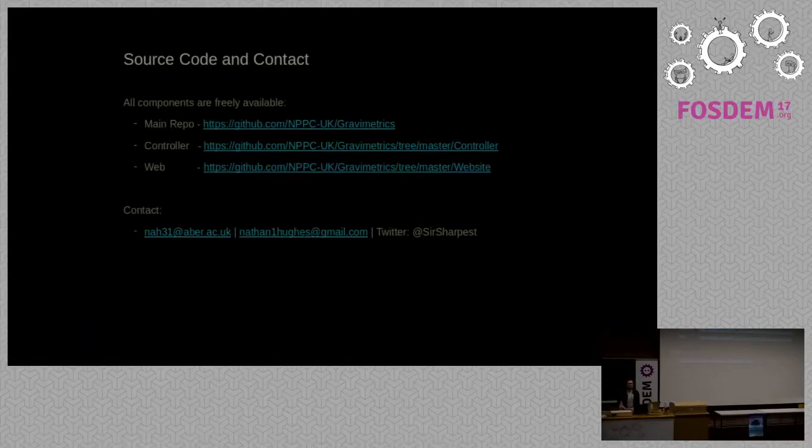Hello. So my question is related to the previous one. Did you also design the sensors like load cells, or did you buy them off the shelf? No, at the minute they're off-the-shelf ones, but we've been looking into building our own to try and get more accurate readings and to play a bit more with what's actually coming out of them, because there's so much variation in it. Because load cells aren't meant to be left on 24/7, there's a lot of tweaking you'd want to be able to do on the very low end of the hardware. So that's on our GitHub at the minute. Some of our plans and some of the research we've been doing into the hardware side of how load cells actually work.